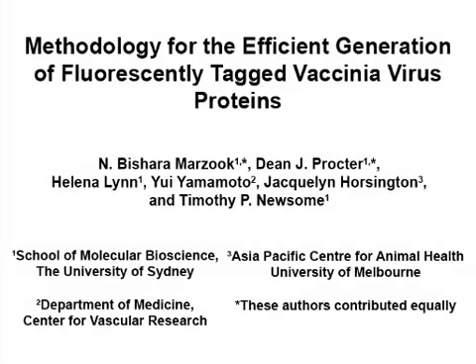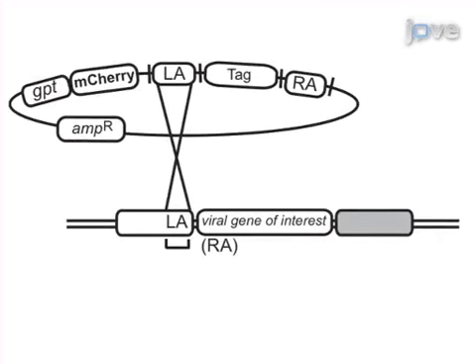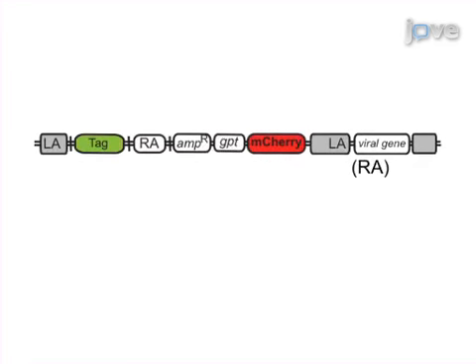This experiment generates fluorescently labeled recombinant Vaccinia viruses through a modular and rapid method based on transient dominant selection. First, create a recombinant vector containing a fluorescent tag surrounded by synthesized minimal regions of homology, as well as markers for metabolic and fluorescent selection. Transfect this recombination vector into infected cells and amplify for recombinant viruses using metabolic selection and fluorescence.